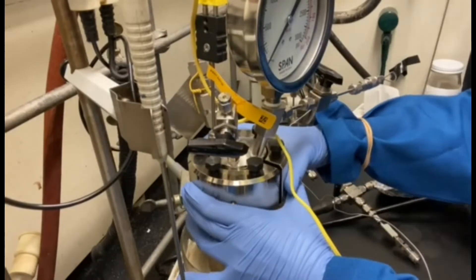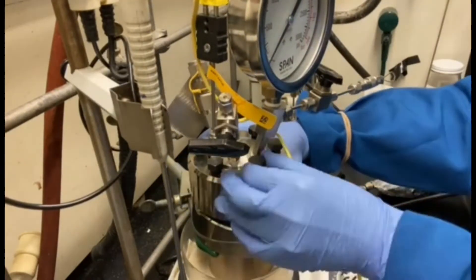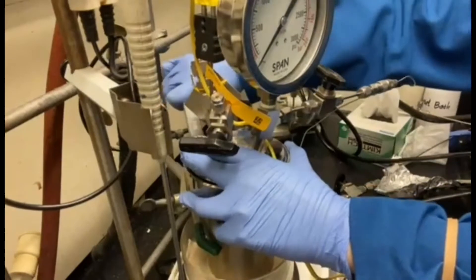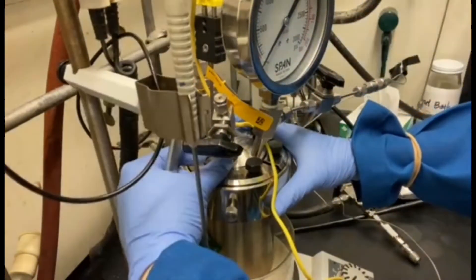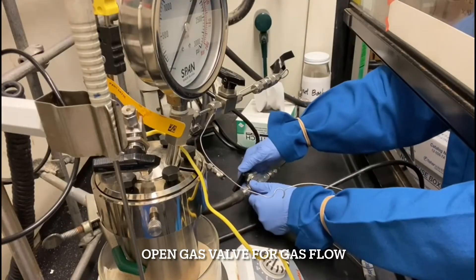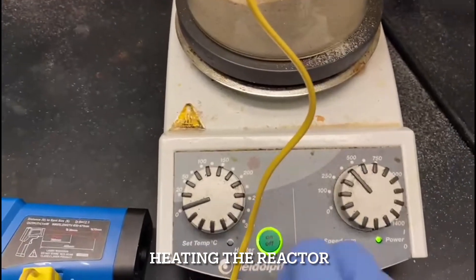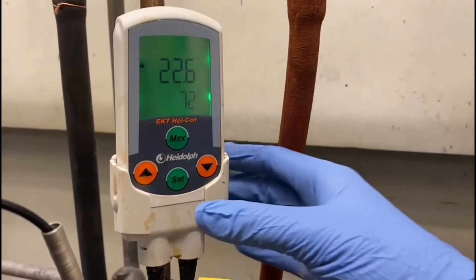Afterwards, the reactor head is tightened to ensure that no gas will be leaked into the atmosphere. The valves are open to allow gas flow into the Paul Reactor. Finally, the temperature of the Paul Reactor is raised by adjusting the dial on the hot plate.